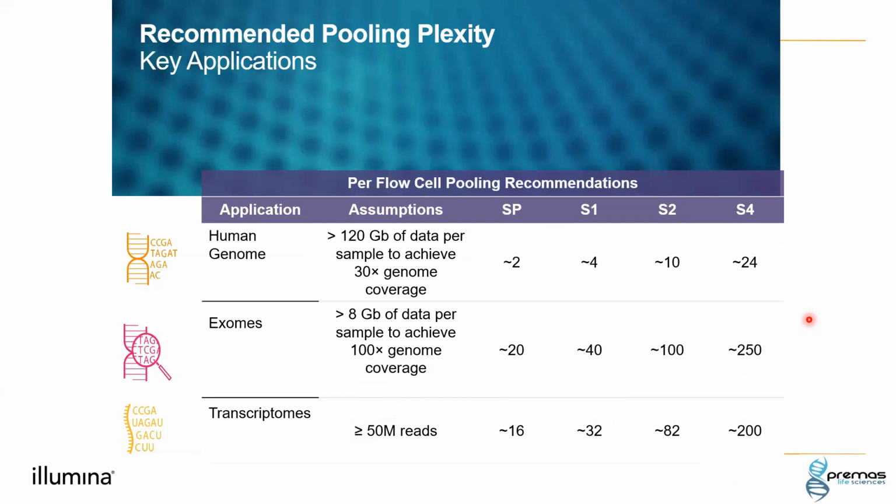individual library types, also different library types. Basically, you have to follow a different workflow for that, but yes, it offers you that capability also, that the individual lanes can run different libraries. So this was all for the entire range.